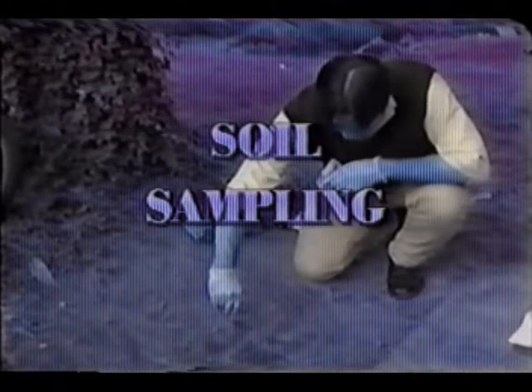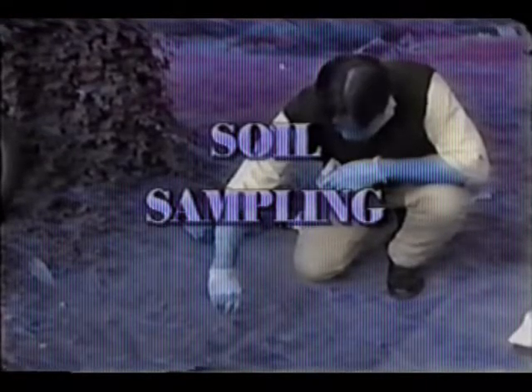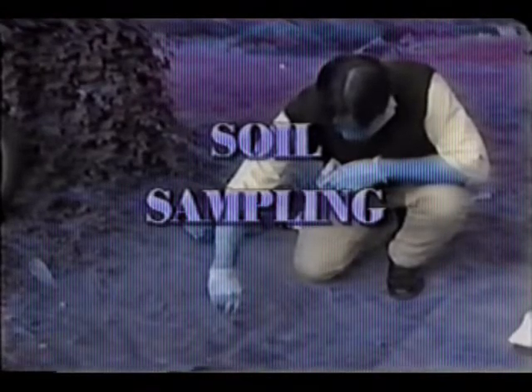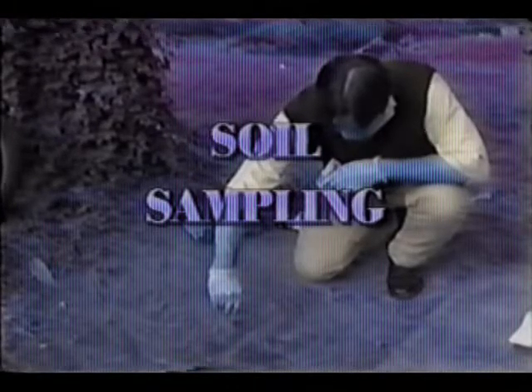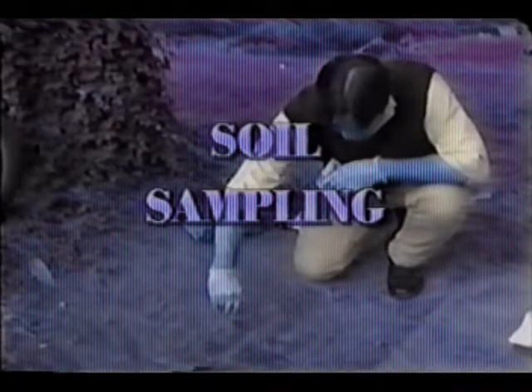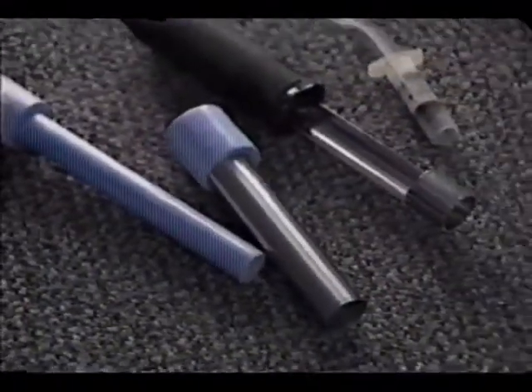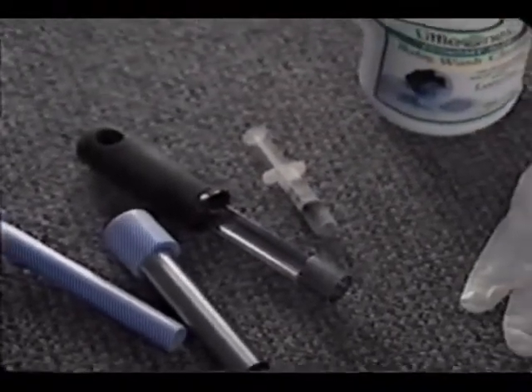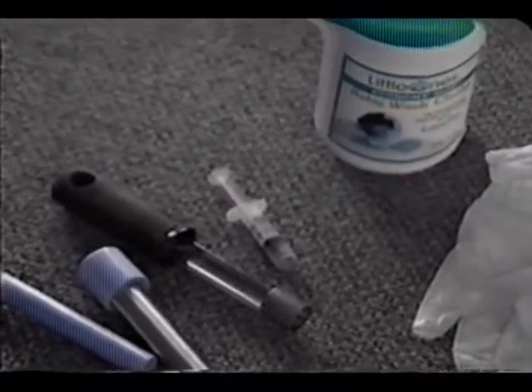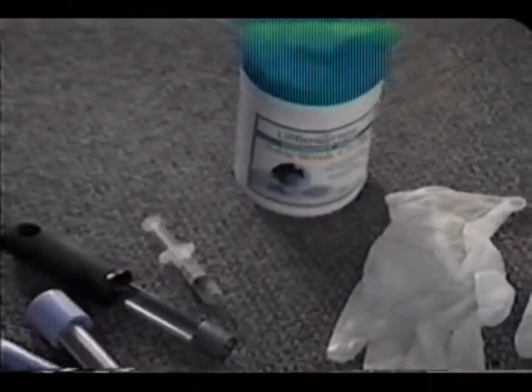For routine risk assessments, composite soil samples should be collected. Each composite sample usually consists of 3 to 10 subsamples mixed together in the same container. These are the tools you will need for performing soil core sampling. First, you'll need a core sampling device, such as a professional soil probe or a 5 cc disposable syringe with the end cut off. You'll also need disposable wipes to clean your tools.